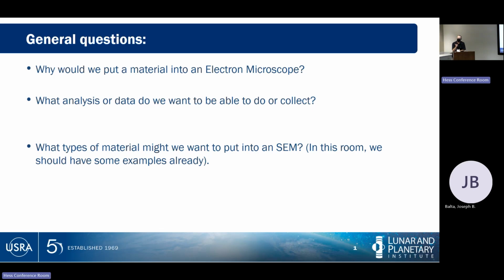Okay, it's BP, right? Mind if I use you as the example since you've got the weird stuff? All right. Let's take that stuff that's in a liquid, okay? What is it that you'd want to learn about or measure with that? Okay, so a key question that I'm going to single in on out of that is the phrase, when it's drying. So are you asking us to try to have this as a liquid droplet in the electron microscope? No. Okay.